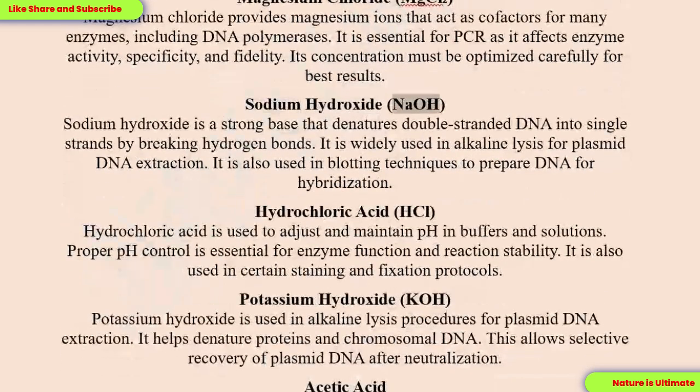Sodium hydroxide, NaOH. Sodium hydroxide is a strong base that denatures double-stranded DNA into single strands by breaking hydrogen bonds. It is widely used in alkaline lysis for plasmid DNA extraction. It is also used in blotting techniques to prepare DNA for hybridization.